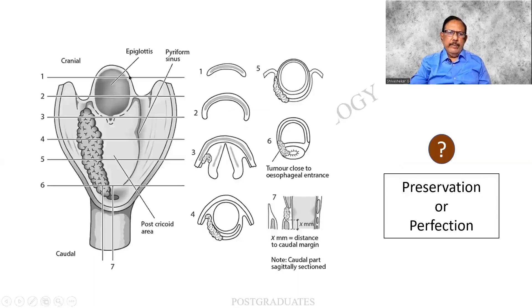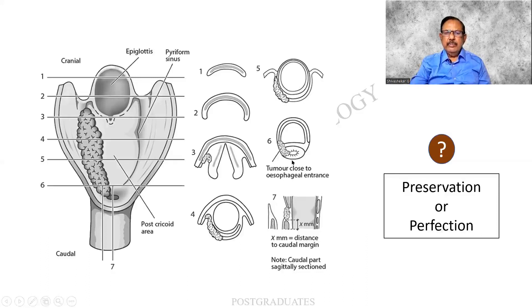The epiglottis, the pyriform sinus — this is again a notorious area for malignancy. As multiple bits are being given, the extent of tumor invasion can be assessed. In this case, it is almost close to the esophageal entrance, which is something to worry about. What is important here is preservation of the specimen or perfection — you people should decide.